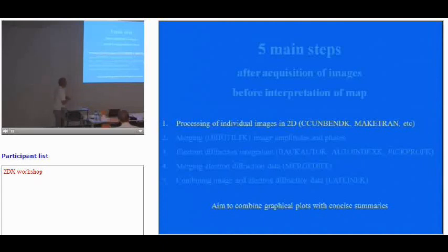They could be tilted images or untilted. And the approach that we took originally was that it was very important for the person doing the work to know how well they were doing. In other words, it's easy just to throw it into the computer and then something comes out, but how do you know it's right? How do you know that this way of doing it is better than that way of doing it? So our approach always was to try and create really nice ways of looking at it so that you could just run your computer program and then look at the output, and it would tell you something enough for you to make a judgment as to whether you were doing it right or well, and whether another way of doing it was better or worse.